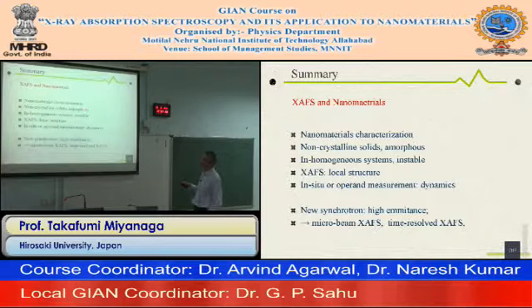It's a very nice merit. And EXAFS detects only local structures. So nanomaterials are different from crystal structures. They are very locally characterized.